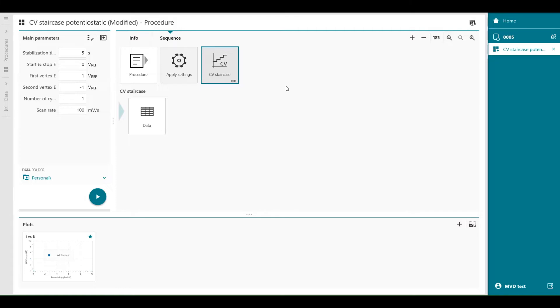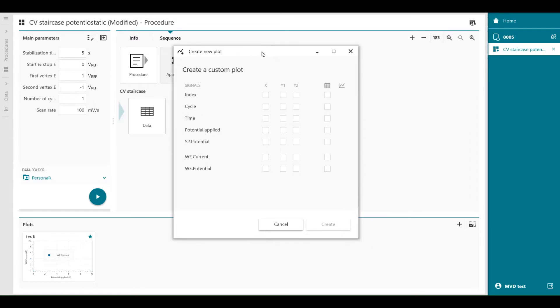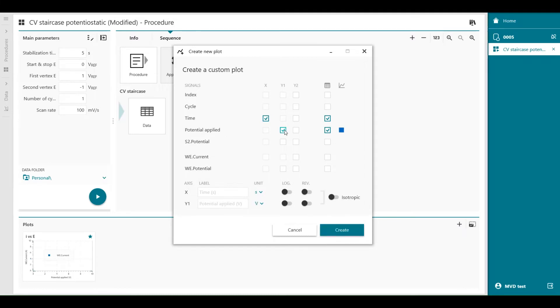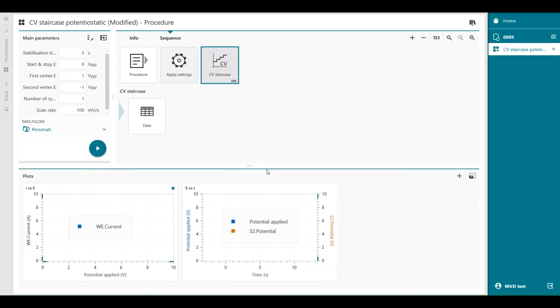We can create a specific customized plot by drag and drop of the command in the plot ribbon, and press custom plot. What we would like to see is the time on the x-axis, the potential applied on the left y-axis, and the potential which we measure — the S2 potential — on the right axis. We're also going to copy it isotropic so we can see the difference in the axes. Now you'll see on the left side the potential applied and the measured potential on the second sense, with different colors.